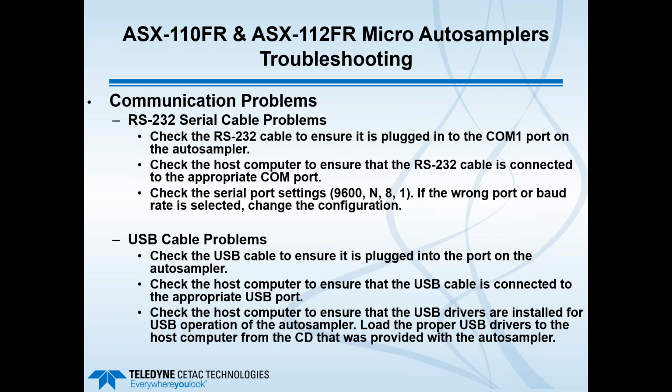Communications, again, can be either RS-232 through a serial cable or a USB cable. Again, you want to check that those are plugged in properly and that you have selected the proper COM port for either RS-232 or a USB cable.